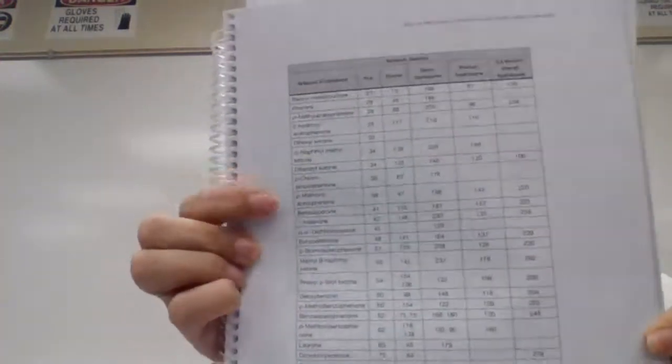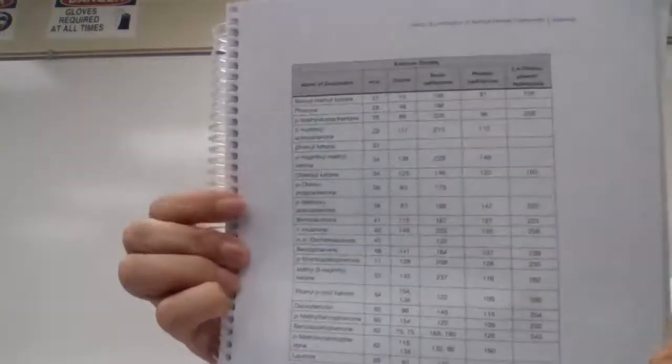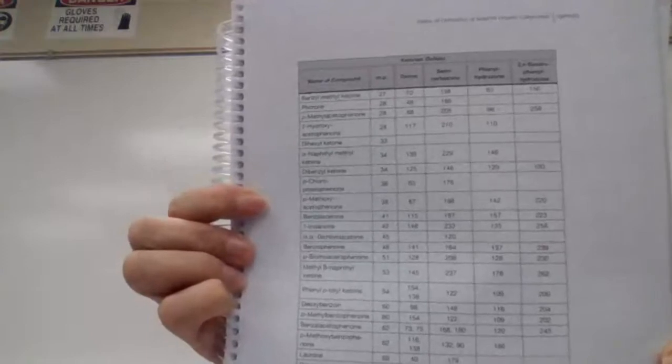That table shows the physical properties for those ketones. You find the melting point, and then from the chart you can match it with the melting points of the compounds on the table. And if it happens to be a methyl ketone, there is a great chance that that would be your compound.